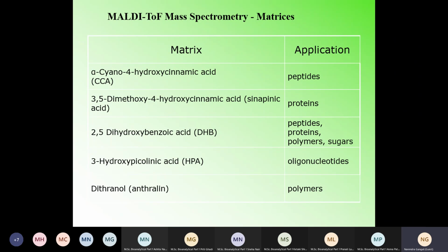Because these are very simple molecules. Something which is less than 1000 molecular weight is a very simple molecule. You do not need MALDI for that. You cannot use a hammer just for killing a fly. So very small molecules, less than 1000 Dalton, there are many other simpler, very cost-effective or cheaper techniques. You do not need MALDI for that.